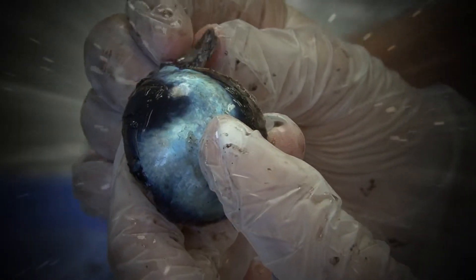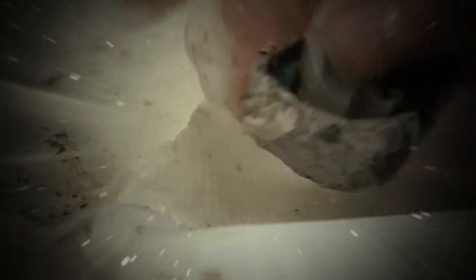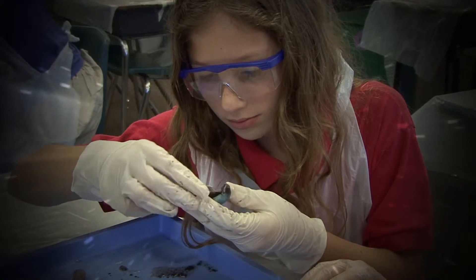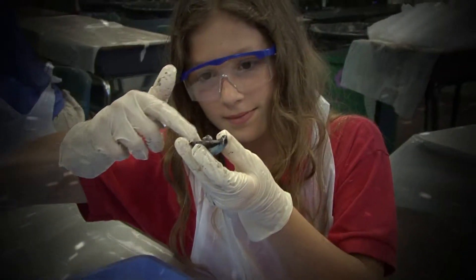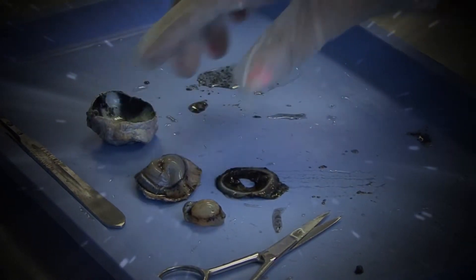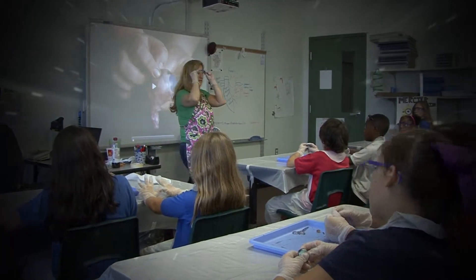The shiny bluish thing is called the tapetum, and this is found in all animals that have good night vision. We don't need that — we're optimized to see things as best as possible during the day, and it would actually interfere a little with our daytime vision if we had it. Pretty cool? When you have just dissected a cow's eye, give yourself a round of applause.